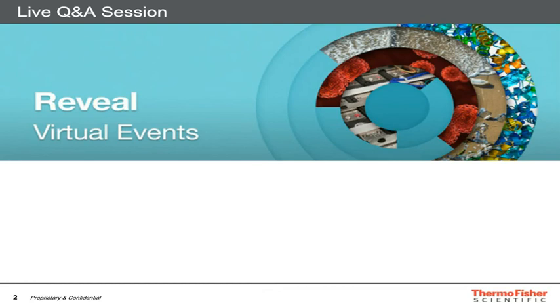I would like to open the Q&A session by thanking our presenters for the insight that they just gave us into the topic of new energy storage technologies. And I would like to open a 10-minute Q&A session with the first question. I think this question is to Paul. What is the highest sample dimension that can fit to the XPS system?